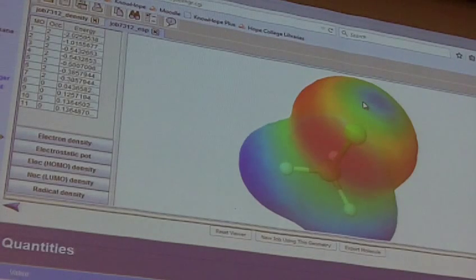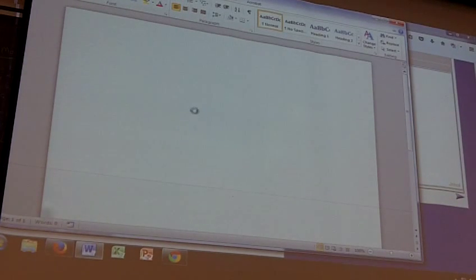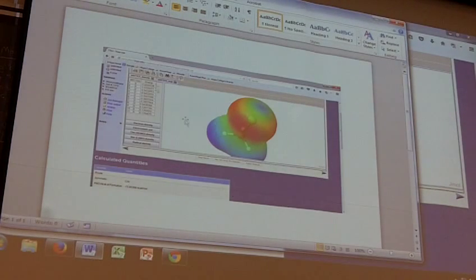The other thing with this is just make sure that you are following the directions really carefully. Okay? So now, another thing you need to know is you're going to have to be able to print screen what you're using. To do that, you're going to hit Alt and print screen on your computer, and that basically copies what that screen looked like, and then we can go to Word and paste it, and then we have a screenshot of what you're looking at.